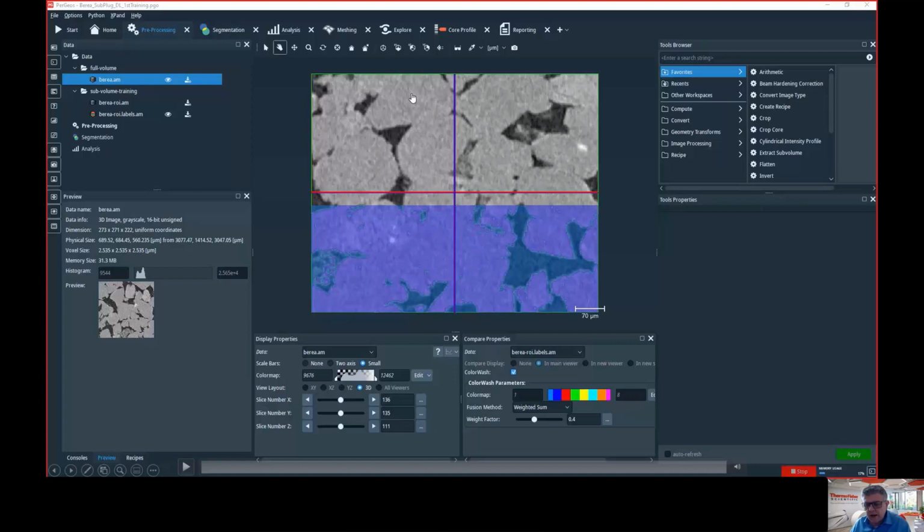In real life, you probably have many data sets, and you will learn from a few of them, and then you will predict on others. Or you have a huge micro CT, with, I don't know, 2,000, 3,000 slices. You will segment part of it manually, and then say, okay, now try to learn from this manual segmentation I've done and predict on the entire data.